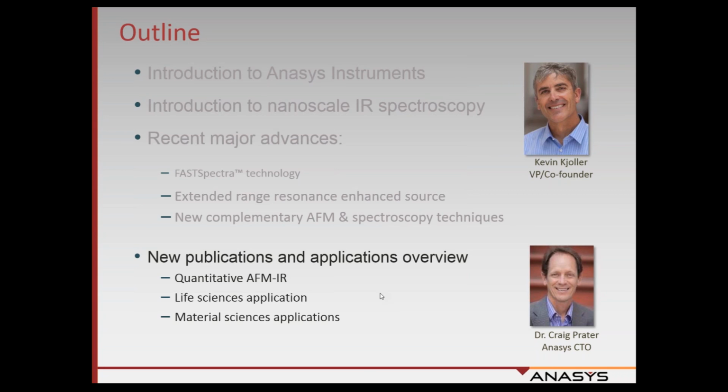All right, thank you very much, Kevin, and thank you everybody for staying and listening to the second half of the presentation. I want to hit on three main points related to new publications and applications. And one is there's an exciting new publication out of CIAC and Exxon demonstrating the ability to do quantitative measurements of concentration with AFM-IR. And so I'll talk about that.